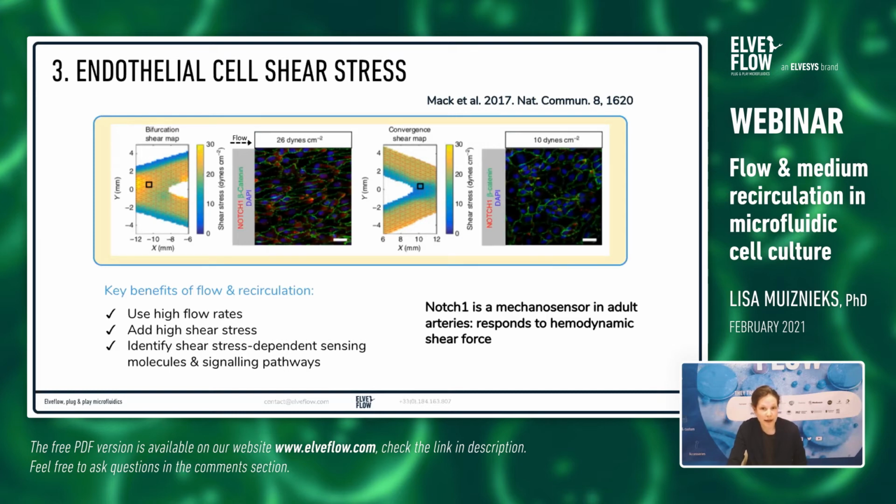Endothelial cells under high shear stress are known to elongate and orient in the direction of flow, as seen here. The cell-cell barriers are stained in green, and the cells are elongated and oriented in this flow direction. The researchers then showed that Notch1 was activated in endothelial cells in response to laminar flow proportional to the shear stress that was applied and was polarized to the downstream position of the cell. Shown here is Notch1 in red at the tips of the cells, especially under conditions of the higher shear stress compared to the lower used here.